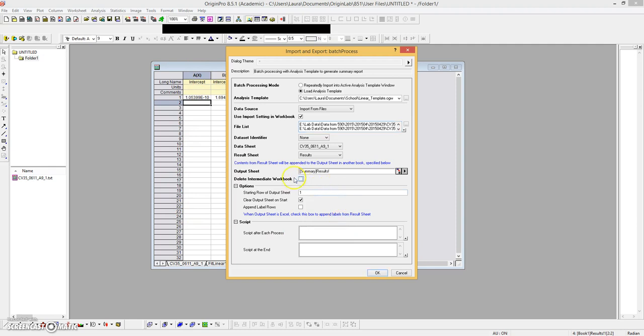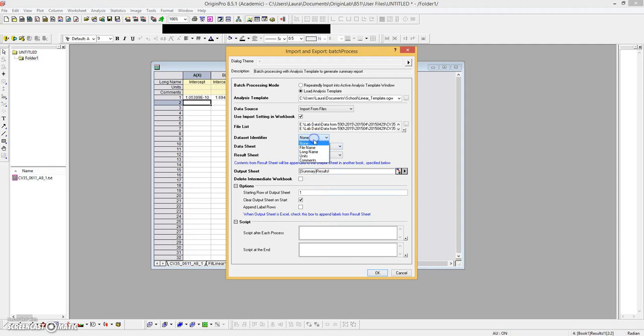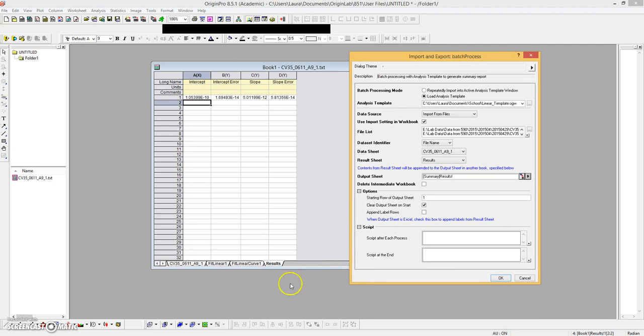I'm going to uncheck it because I want to look at each of the intermediate workbooks and the results file. So we want to put in our data set identifier so we know what we're looking at in the results window. The results sheet is just called results. Remember we just renamed that. That's this sheet. And the data sheet is this one.